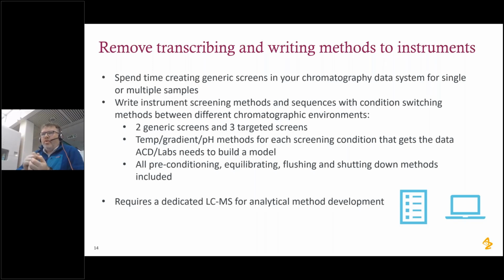They can run those samples without too much effort in creating all of these methods or sequences in the background, and we do get a first pass result of data that they can look at and start to see, right, what is the most optimum area that I need to focus on next.